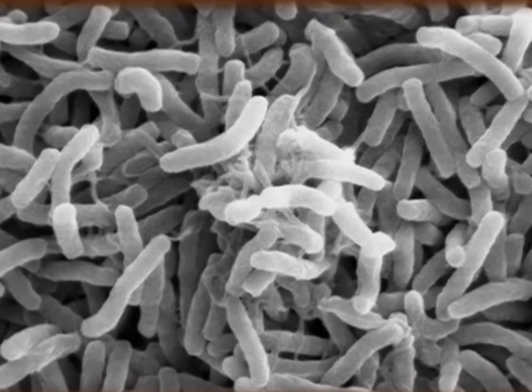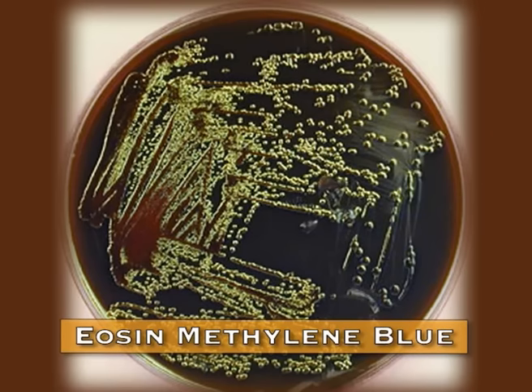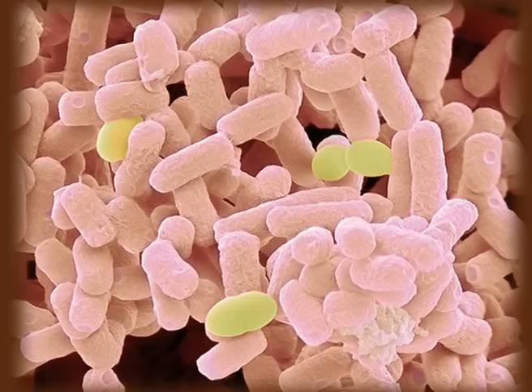Examples of selective media are EMB, commonly known as eosin methylene blue. How does it select? Eosin methylene blue contains dyes like eosin and methylene blue which retard the growth of gram-positive bacteria. It only allows gram-negative bacteria to grow. An example is E. coli and Enterobacter aerogenes, which proliferate profusely in this kind of medium.